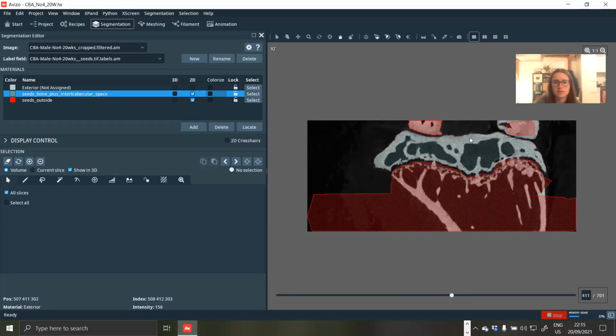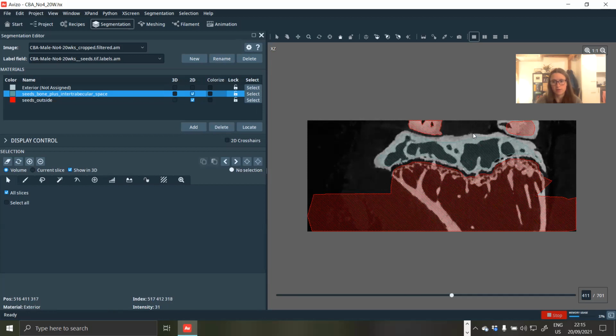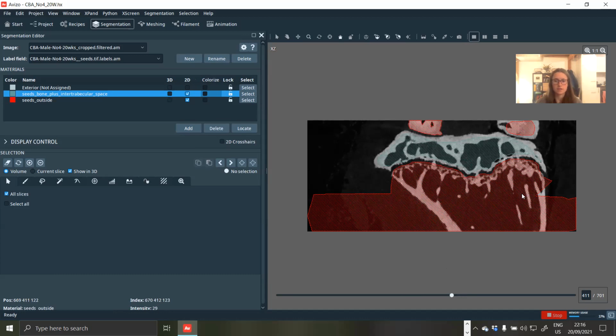The reason for this is that the watershed algorithm works by growing the seeds until they reach a boundary, so a big difference in the grayscale values. Then it'll see, across the boundary, are there any seeds that have already grown up to that boundary and are occupying that space. Here, since I have some of the bone selected, it grows all the way up to the background. But then I've told Avizo, connect all the background with this red seed. And so in the end, we would have the entire background space filled up to the borderline of this bone with red. Again, it works based on gradient differences.